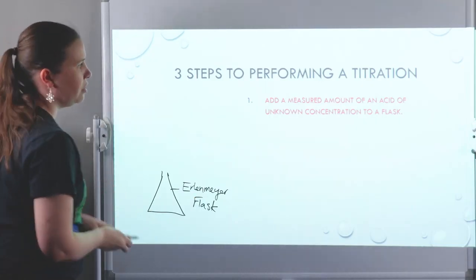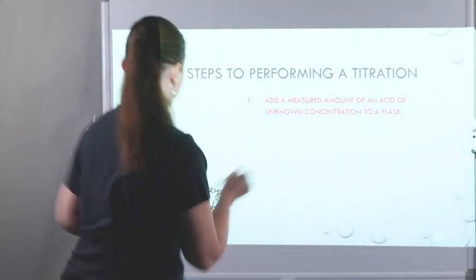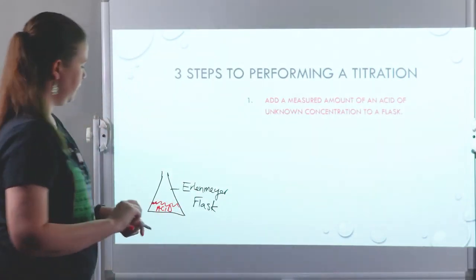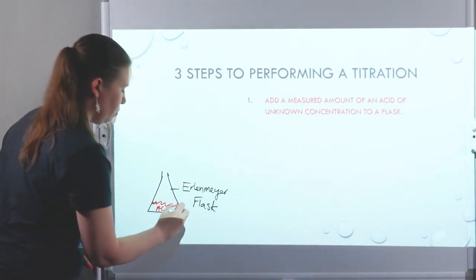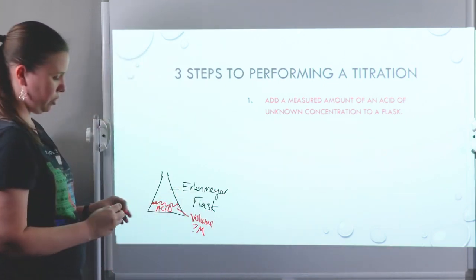In this flask, I'm going to put an unknown amount of substance. So let's go with an unknown amount of acid. So I don't know the concentration, I should say. I do want to make sure that I measure the volume, but I don't know the molarity.